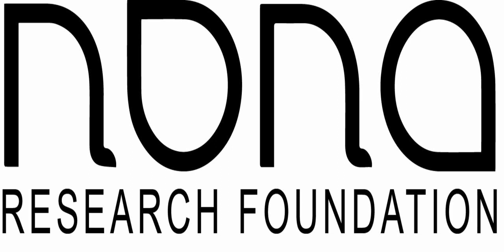Yeah, I guess that is the question of whether we can find tractable solutions. Right now we don't have funding, obviously, to start making this, but that would be the eventual downstream, that we can set up that fundamental baseline that folks can draw from and say, well, I know I need a LIMS application. At least this application starts me off with user authentication, authorization, and a page to add samples.